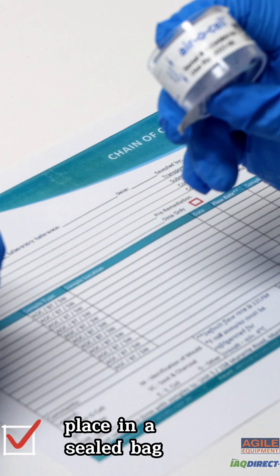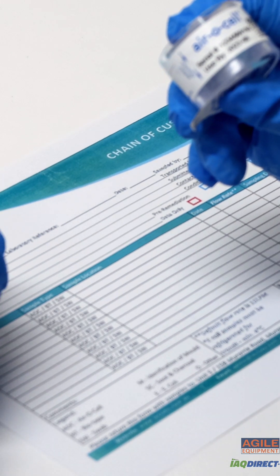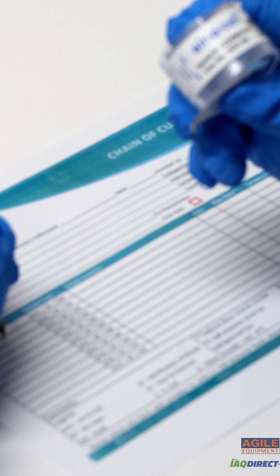Once completed, place into a sealed bag with a chain of custody form and have it sent to your lab for testing.